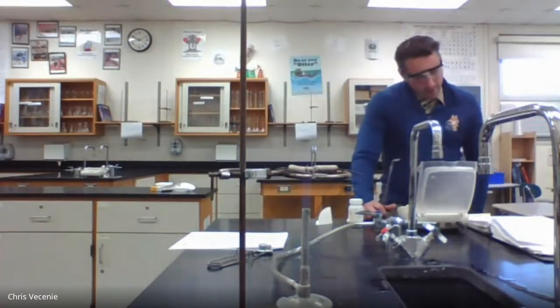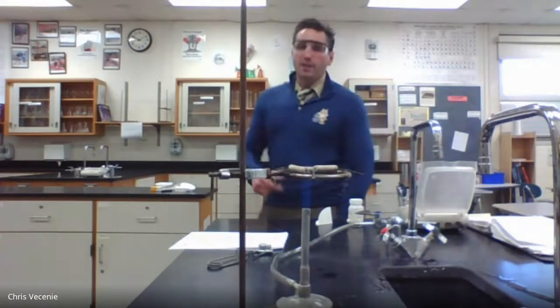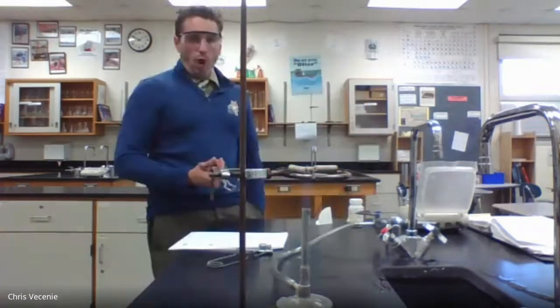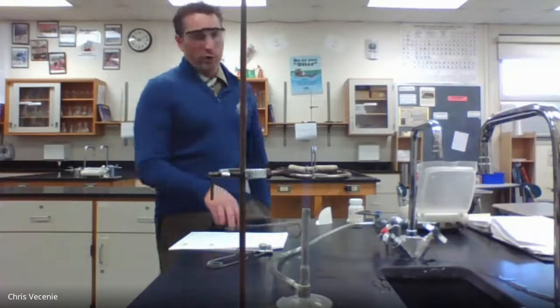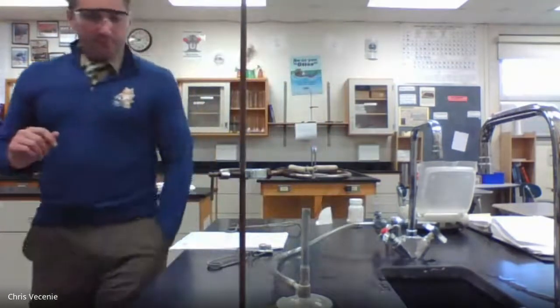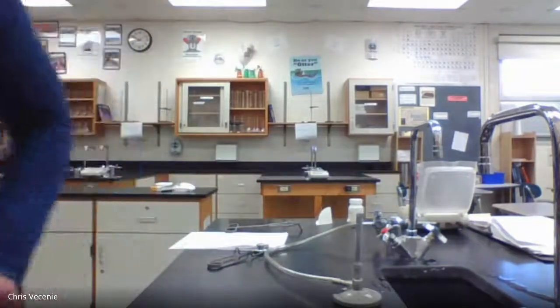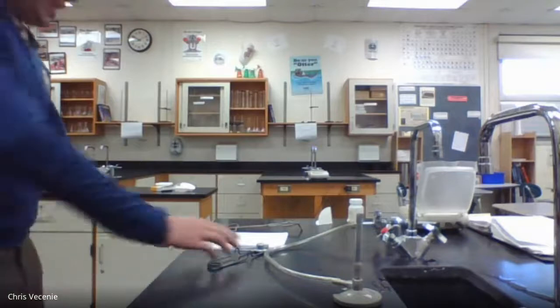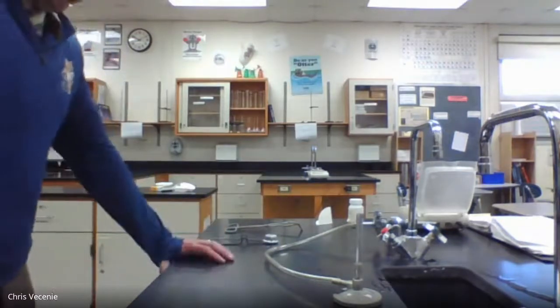This time the number is reading 13.10. So we lost a very tiny bit of mass. We went from 13.11 to 13.10. I'm going to say that is close enough to say we are good. We have heated it enough. So I'm going to shut off my burner, move my ring stand out of the way, and it looks like we're able to push into step number 9.